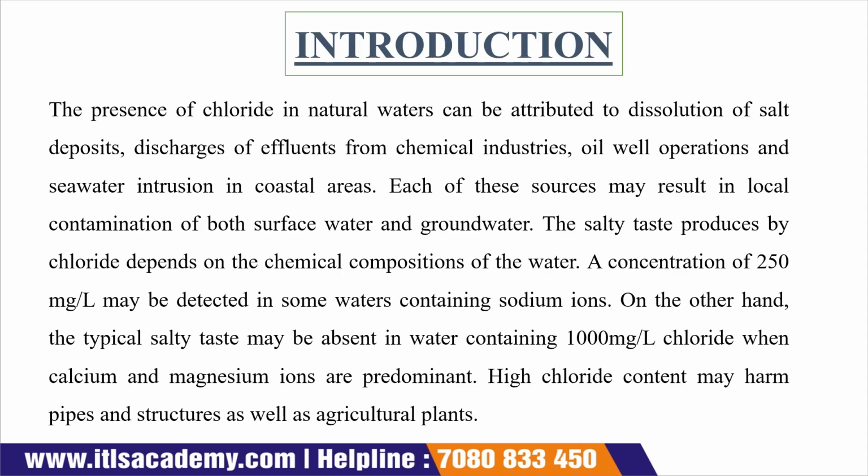The first one is the introduction. We have already discussed this introduction slide many times. Chlorides are present in natural water.